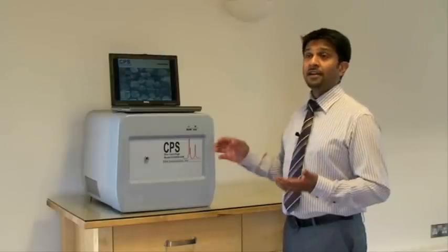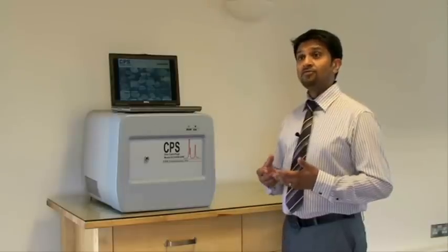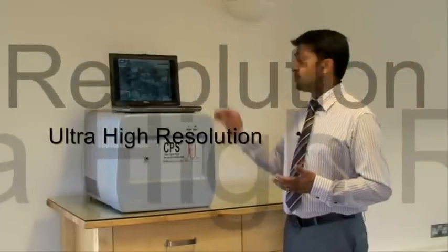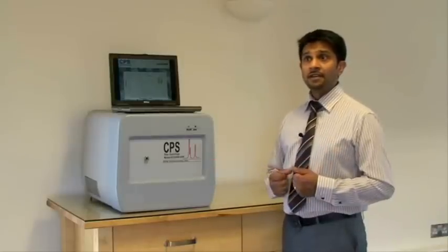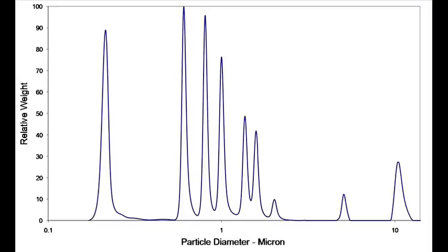This means when you are characterizing a sample where you have many peaks, and in this example, let's say we've got a polystyrene mixture, we've got nine peaks, and as you'll see from the distribution, we can actually separate all nine peaks and resolve them and show them clearly on the screen.